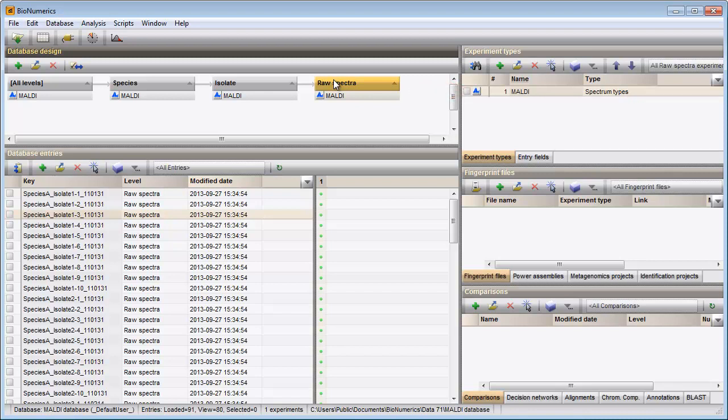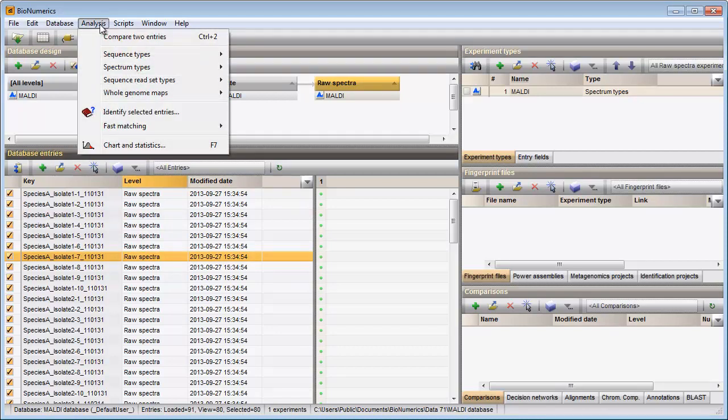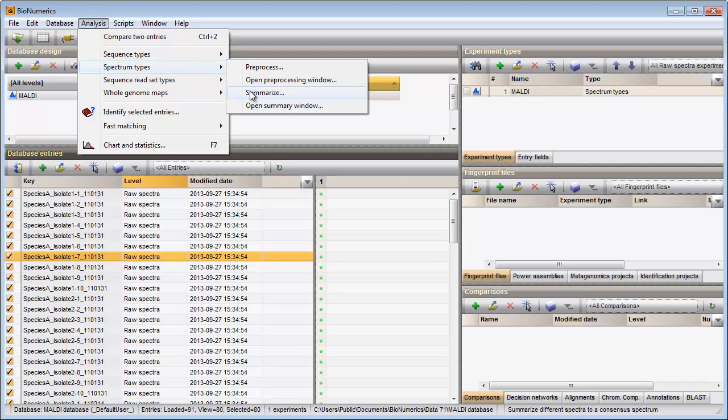In the raw data level I select all entries at once with the keyboard shortcut Ctrl-A. I then select Analysis, Spectrum types, Summarize.